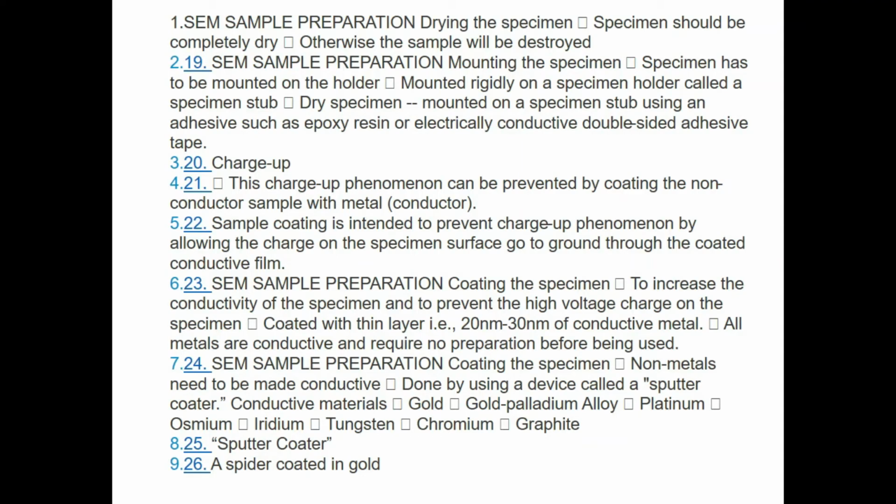For biological samples we have to take one or two trial attempts. You have to check whether it is going to spoil the machine or not, and its capacity. We can also change to some other scanning electron microscope, like the low-vacuum SEM we have seen first, right? That also we can check.